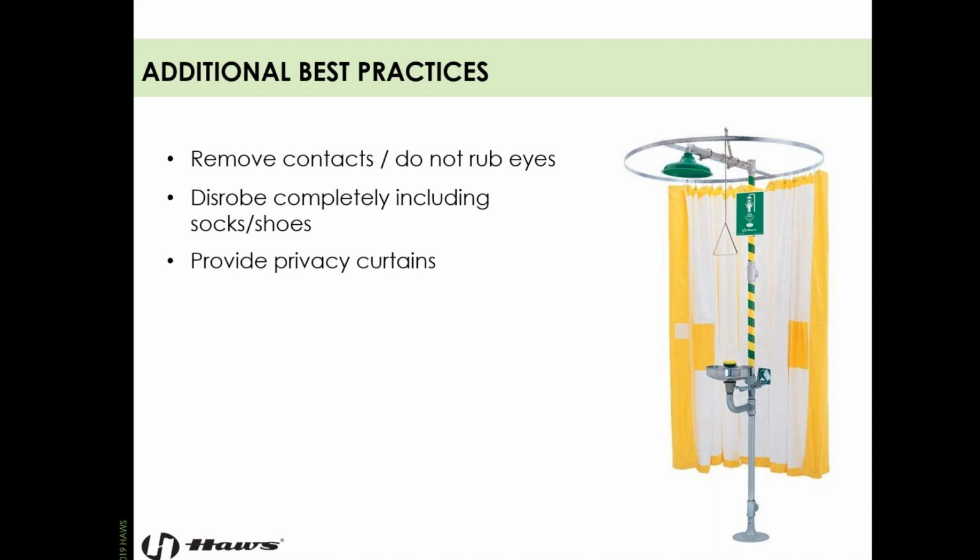With that in mind, provide privacy curtains. This is going to be one of the worst times of your life if you have to go through this in a real emergency, and it's ideal that we give our coworkers some privacy while they go through this.